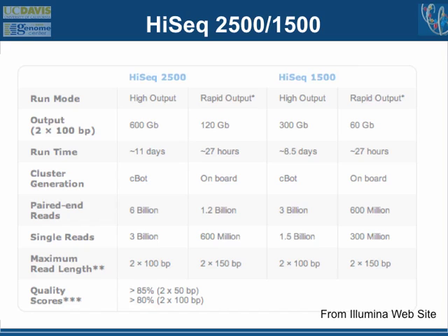So does that make sense? What you're doing is that basically all of the methods have a reasonably high error rate for individual sequences.